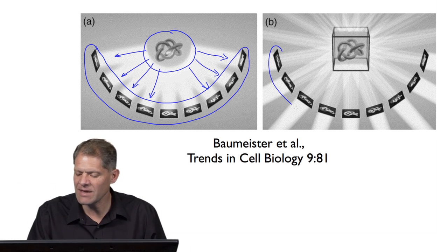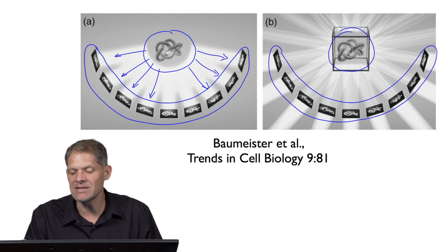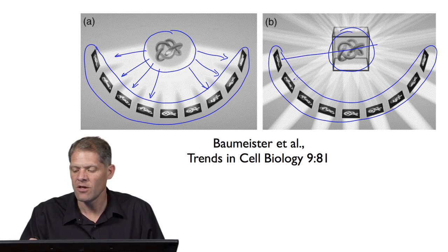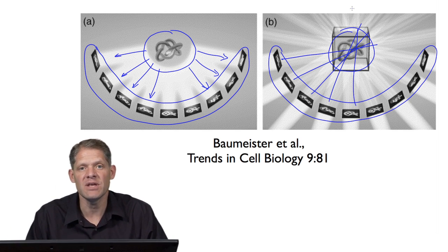we can take that same set of projection images and calculate what is the structure of an object in 3D that must have existed to give rise to all of these different projection images. Conceptually, the way it's done is you can imagine that the structure in each projection is back projected through that volume, and their sum gives you the structure of that 3D object.